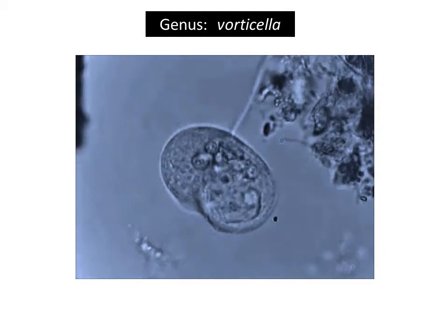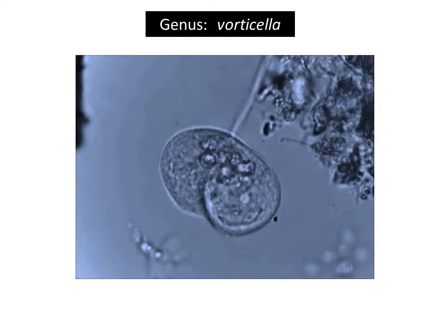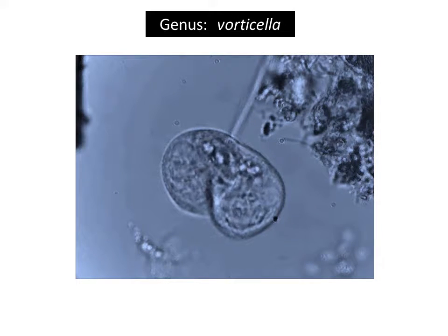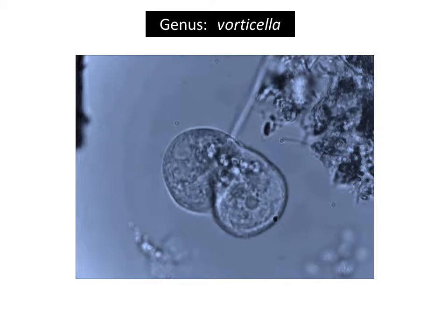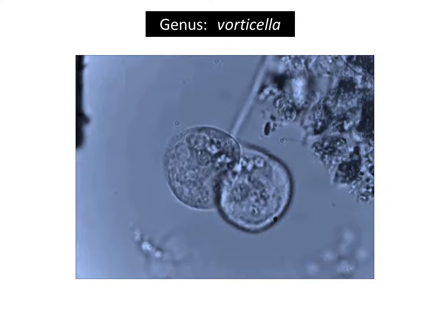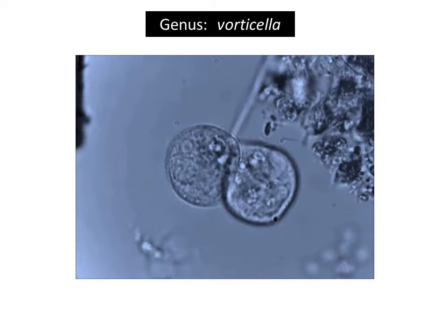The vorticella telotroch. This video movie of the formation of the vorticella telotroch shows late daughter cell formation from a mature sessile organism which has already duplicated its cell membranes, cytoplasm, and organelle content and has begun to divide.